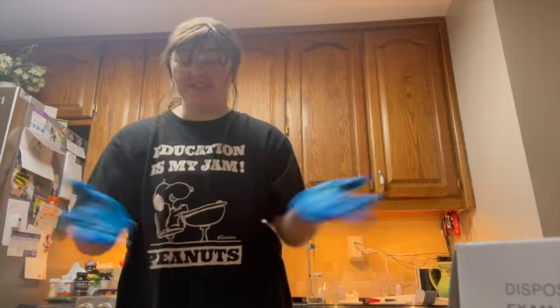Okay, so a little bit later check-in, we're now at 20 milliliters titrated in, and our pH is now at 4.4, which is a big difference from whenever we started at 3.0. So we'll see what happens the later we go.